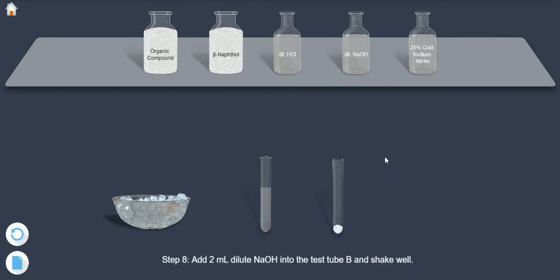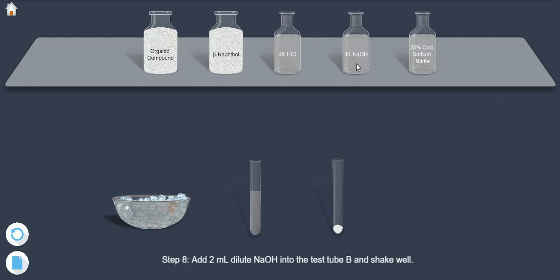Step 8: Add 2 ml dilute NaOH into the test tube B and shake well.